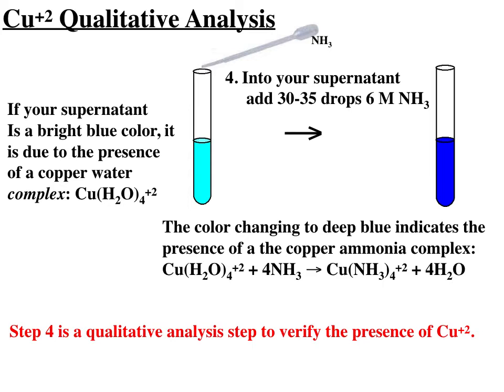If you drip in some ammonia, instead of complexing with the water molecules, the copper +2 will complex with ammonia. And it turns out that copper ammonia complexes have a vividly deep blue color even when the concentration is low. So by adding a few drops of ammonia into the solution, we will form a different complexation between the copper cations in solution other than a water complexation. And this has a very distinct color display when you do so.